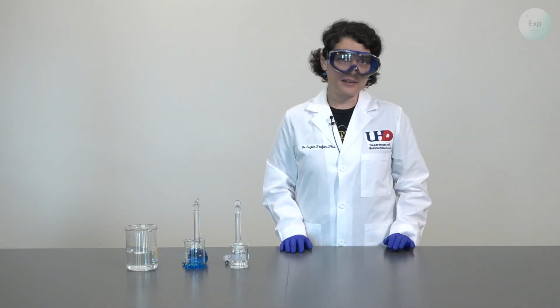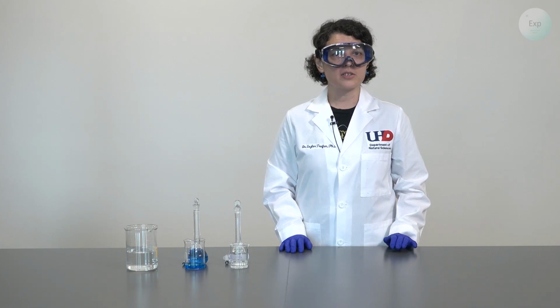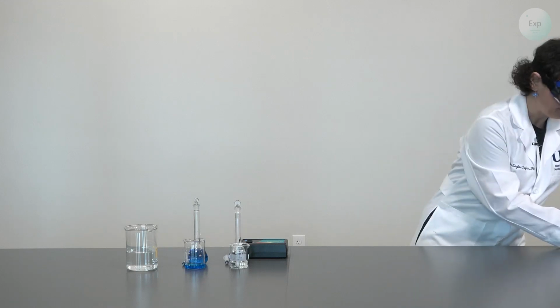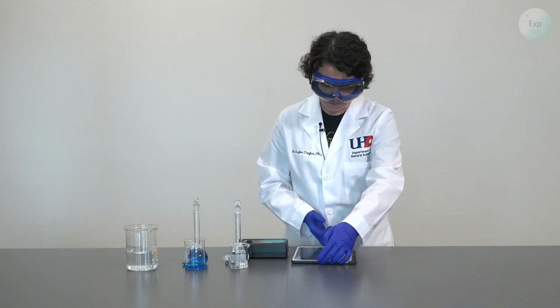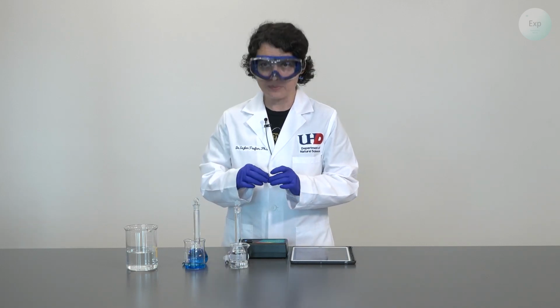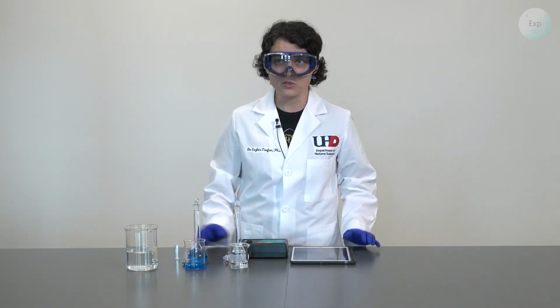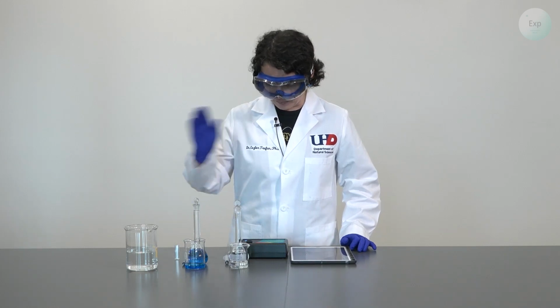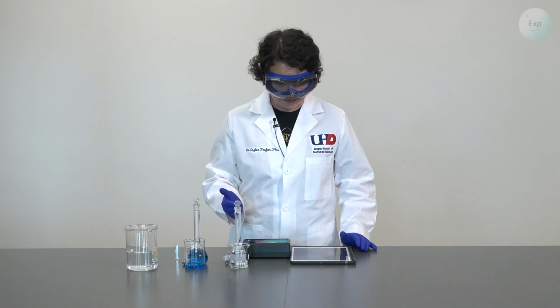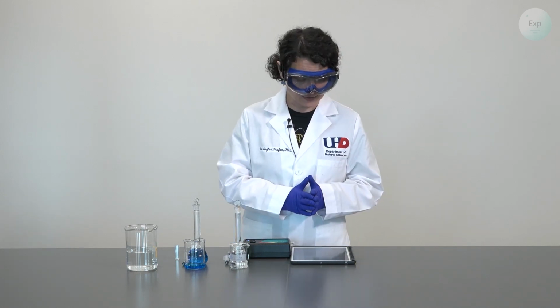To collect my data, I will be using the Vernier spectrometer, which I already connected to my iPad. And I will be using a cuvette. Now, inside this cuvette, I will first place my blue food dye solution, the water, and then I will place it inside the spectrometer, at which point I will add the bleach and commence my data collection.